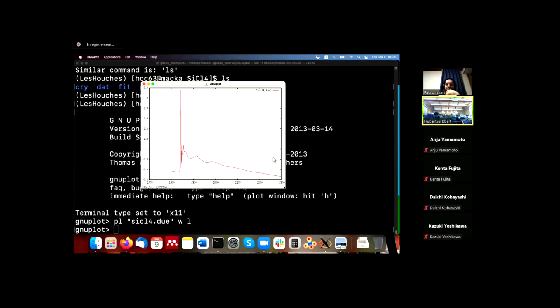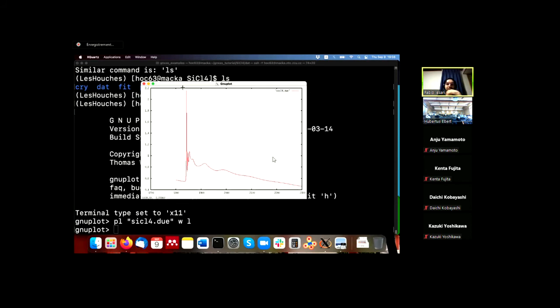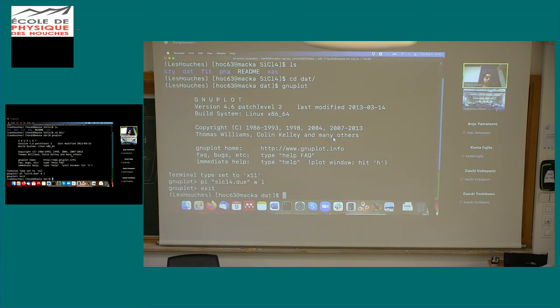Okay, but you can see here this is the experimental data of silicon K edge. So in GNXAS, this is actually the data that is used as fitting. You don't need to do any extraction and then fitting. We just use the raw experimental data as the input file. So this is what will be used.